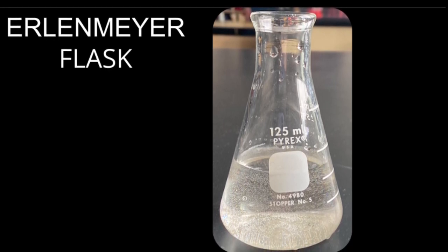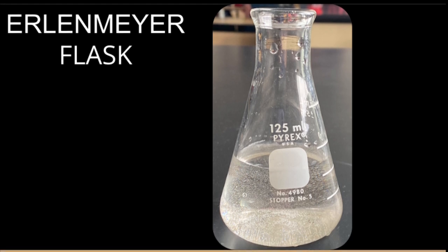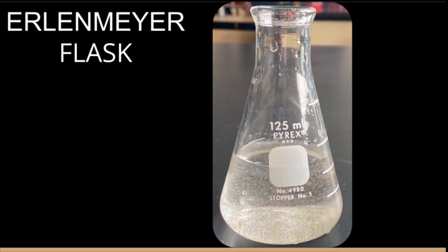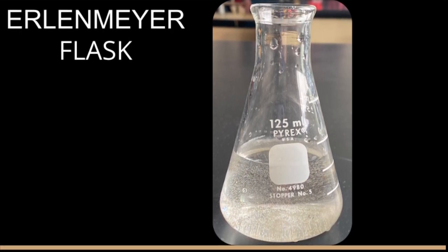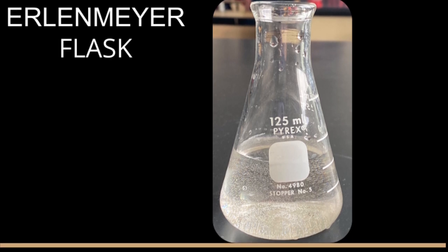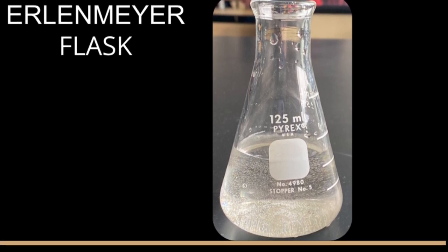They are both used for the same purpose and they are both around the same price and can be used interchangeably. An Erlenmeyer flask can be more beneficial and safe as it has a thinner neck so the cone shape reduces the evaporation and helps prevent spills while mixing the liquid.